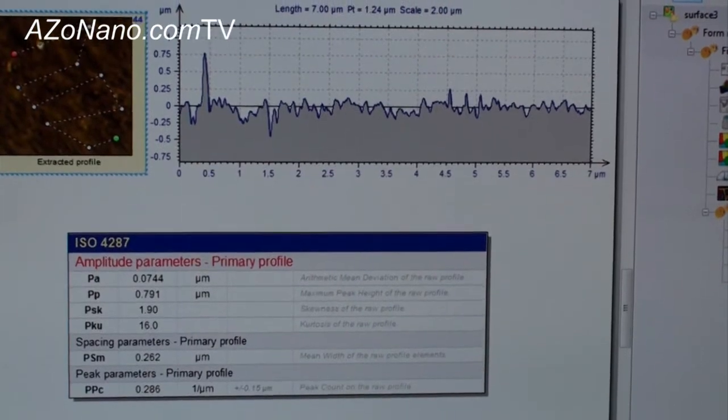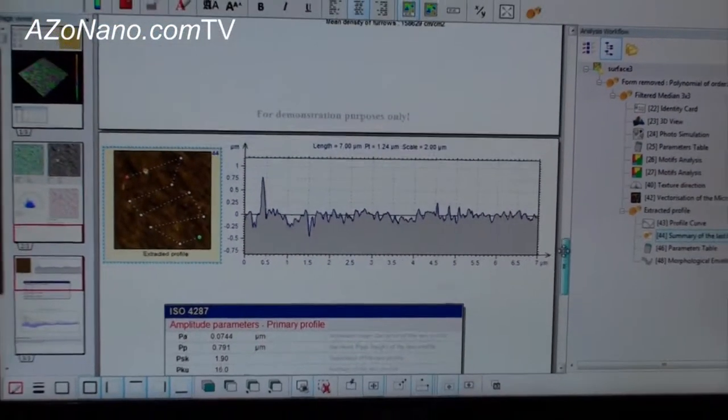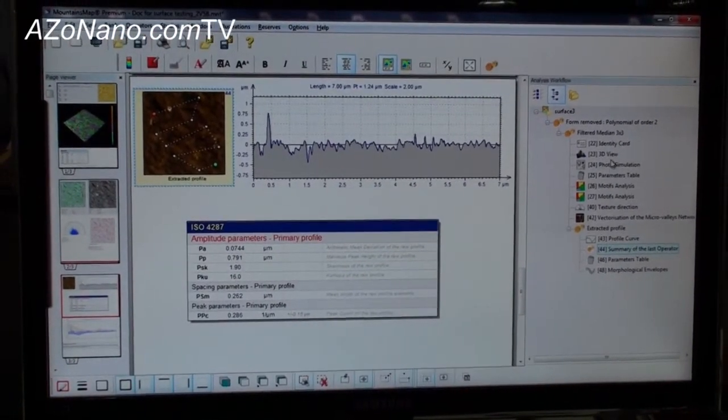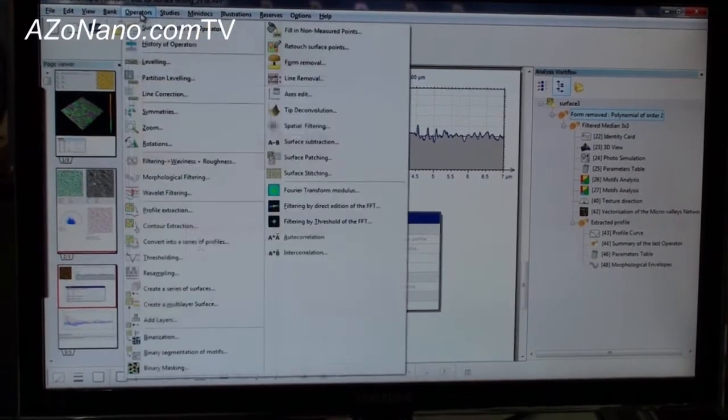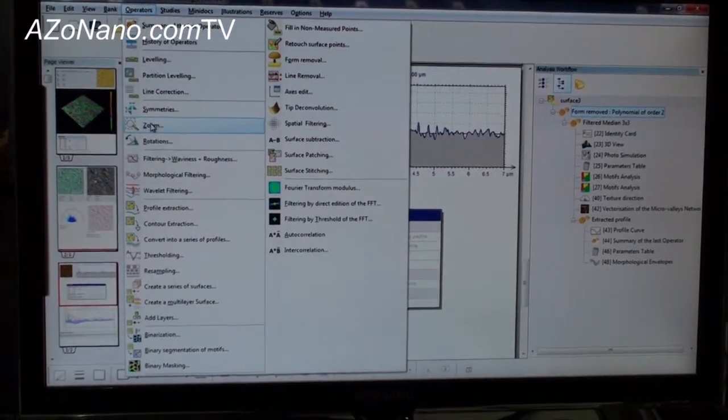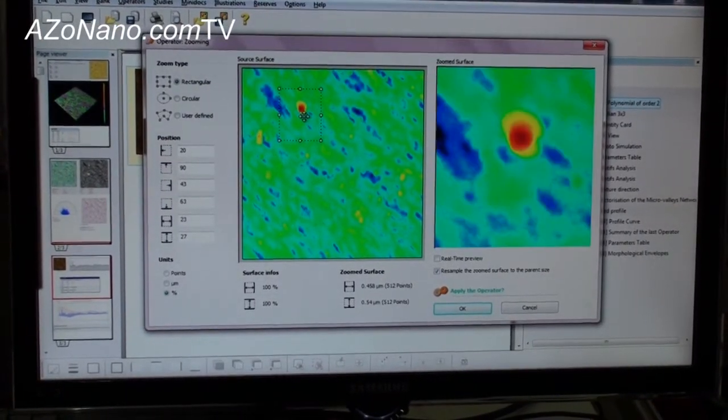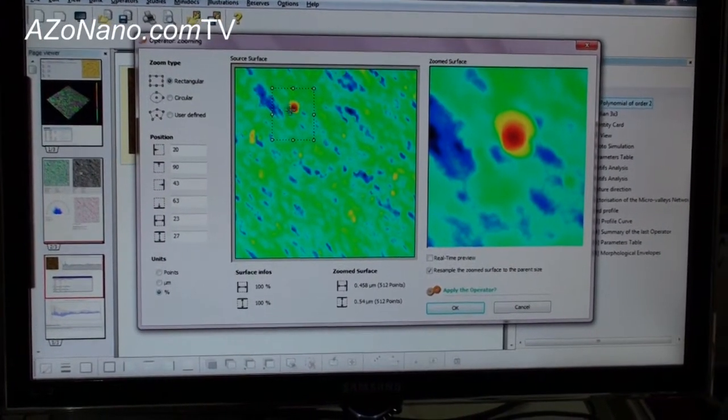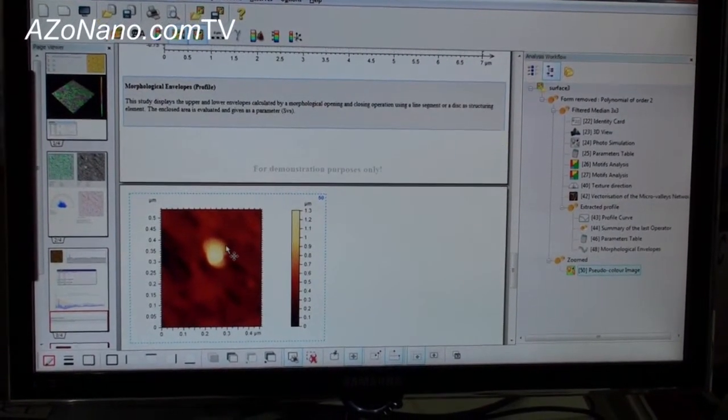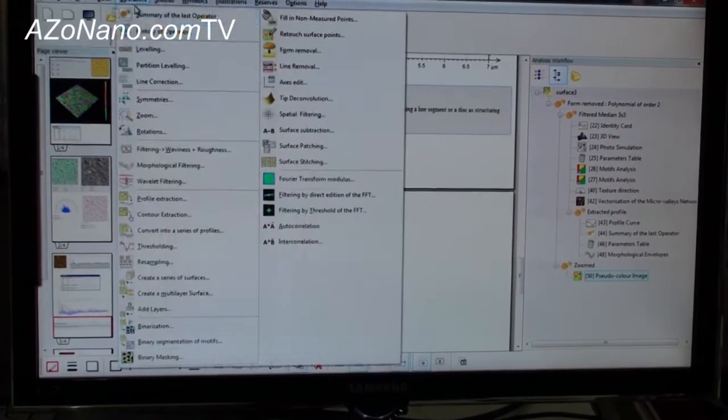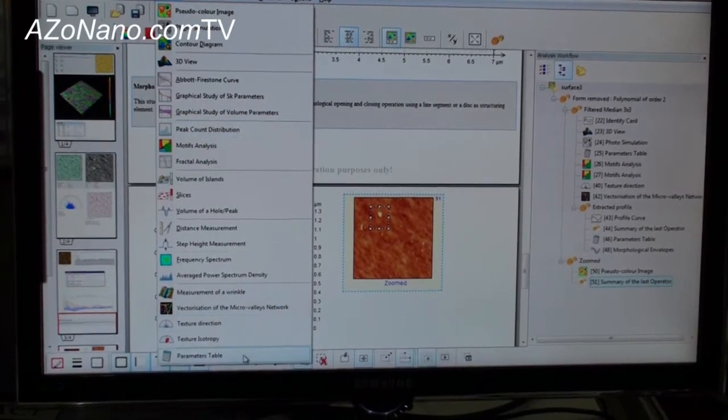And now I have a very large profile extraction with new parameters calculated and refreshed by the new profile extraction. So the software itself is very interactive. Anytime you have a document, you can open it and modify it and eventually you can make some more analysis. For example, I want to add a zoom. So I go to operators, zoom in and I want to zoom on a small particle here.